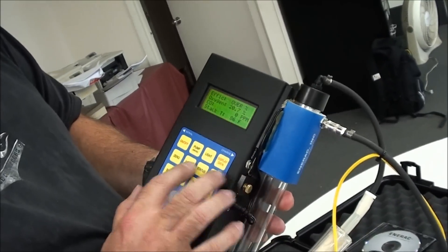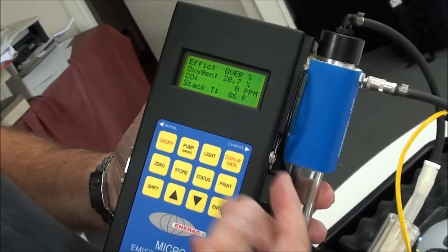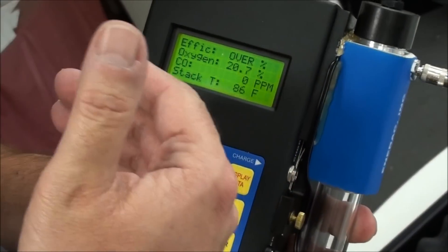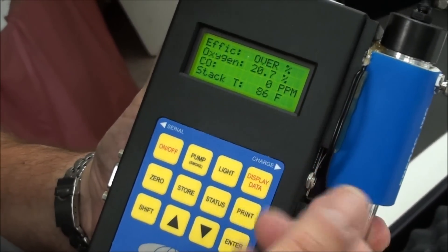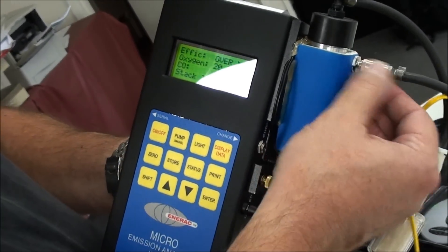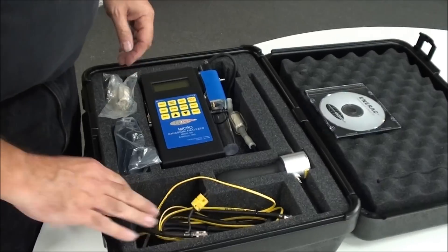Let the unit run. Let it purge. You can put it back on oxygen and CO, or any of the readings, and just watch it and wait for it to come back close to ambient again. At that point, you're done. You can turn the unit off, disconnect your hoses, and put everything away. And that's it. It's that simple.